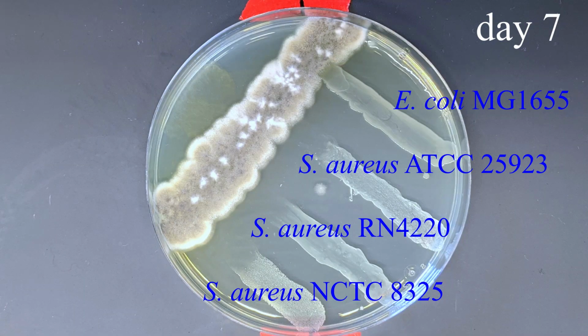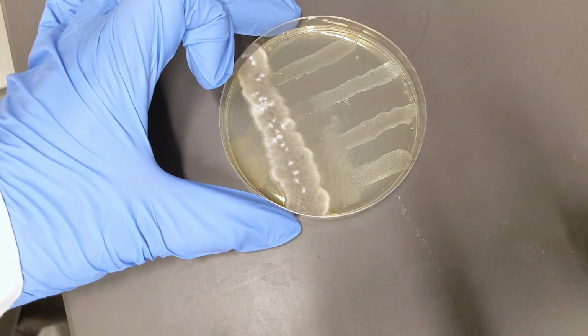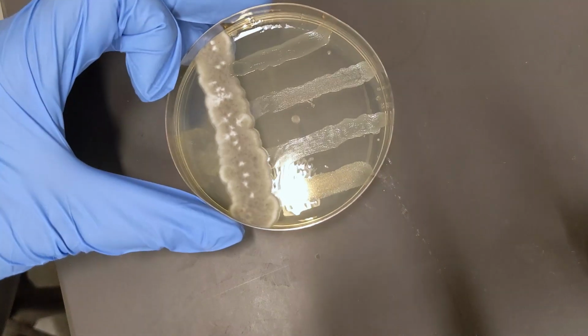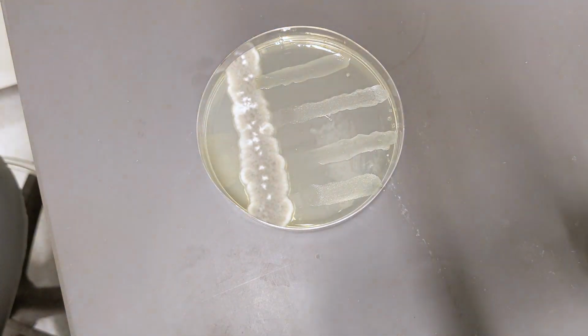In the next 2 days, we see S. aureus strains that are far from P. rubens grow well, but those close to P. rubens are lysed. However, the growth of the E. coli strain is unaffected by P. rubens. This makes perfect sense because S. aureus is sensitive to penicillin, the chemical produced by P. rubens, while E. coli is not.